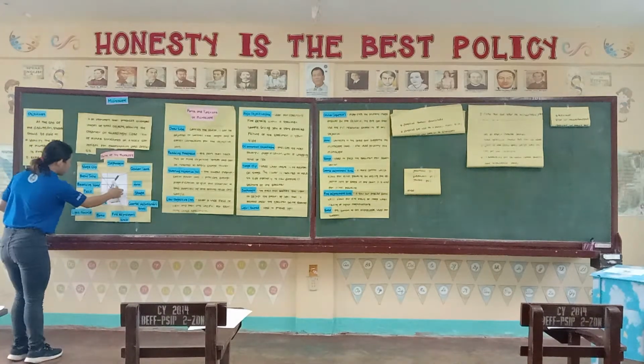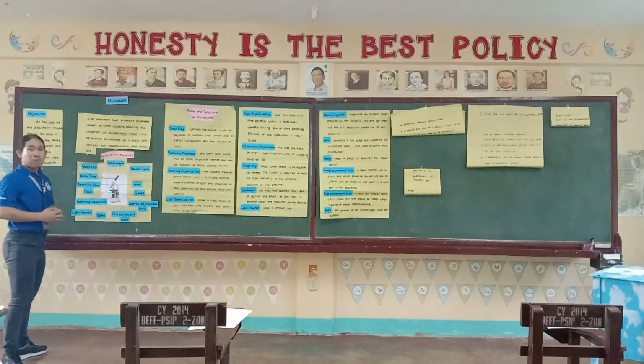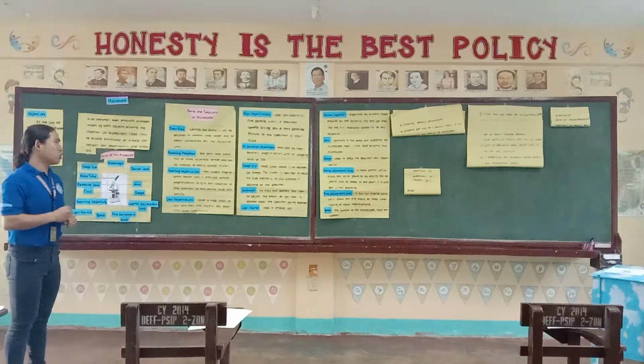So this one over here, the arm. So dili mo siya pwede makubtan para dalhin mo ang microscope.